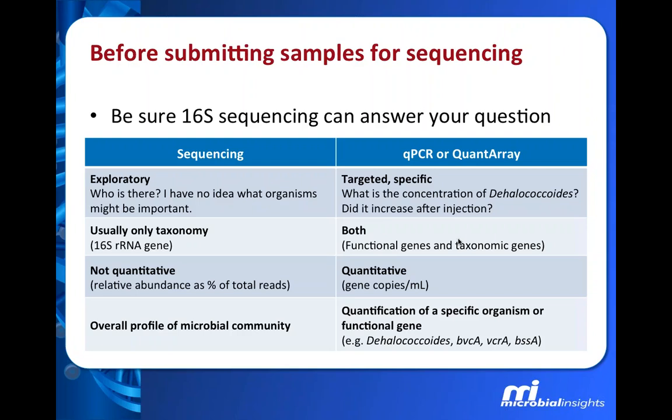Also, one of the more important points I want to bring out today is what I just mentioned. Metagenomics and amplicon sequencing are not interchangeable terms. Don't be fooled in thinking you're getting all the genes in your samples when you're doing this 16S amplicon sequencing. The results there are taxonomy. And one day soon, I think even later this year, or early next year, you're going to see more availability for these metagenomic types of approaches. So we're much closer to being able to get to function rather than phylogeny.